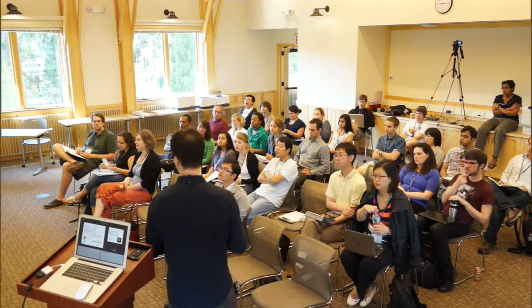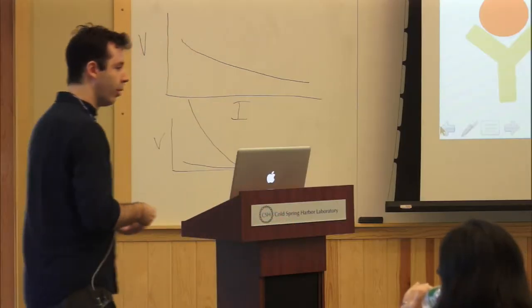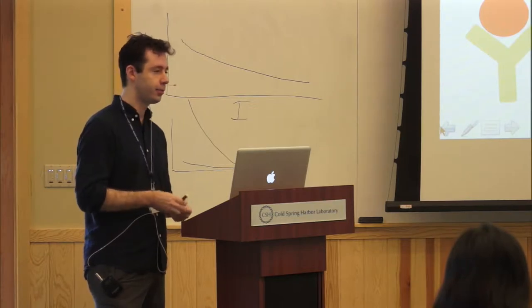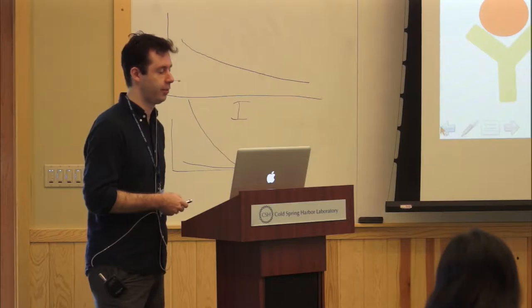So that is a sequence, right? And so how do you identify a binding site for a protein? How can you tell? So you have your short reads, and how does a binding site look like? A binding site looks like many reads piled up on top of each other.